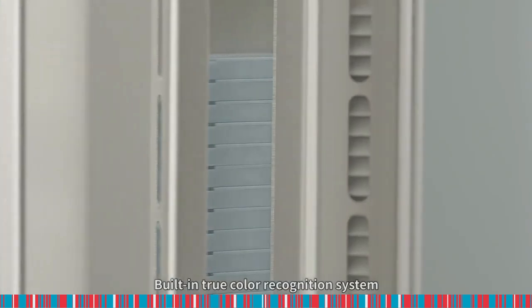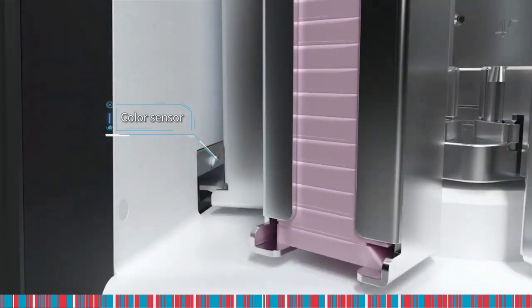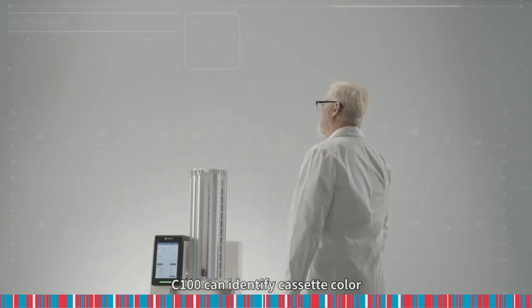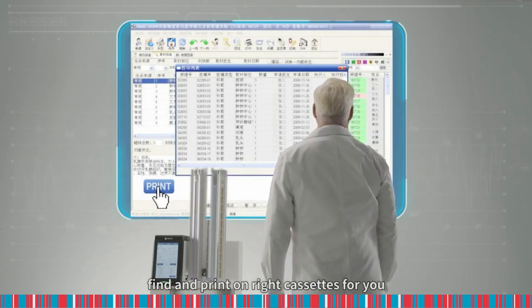Building true color recognition system aids specimen management in the laboratory. C100 can identify cassette color, find and print on right cassettes for you.